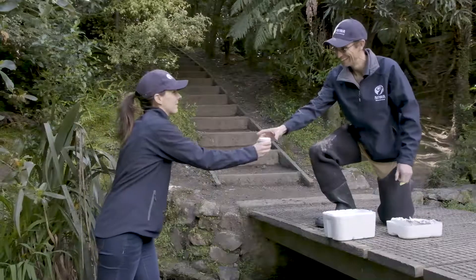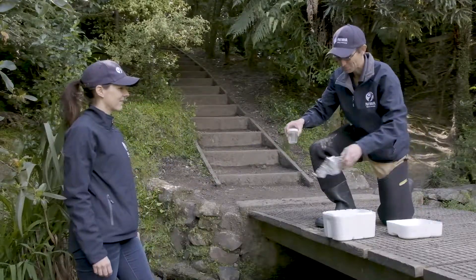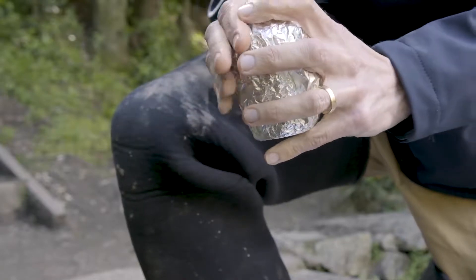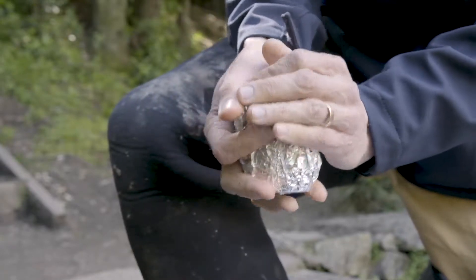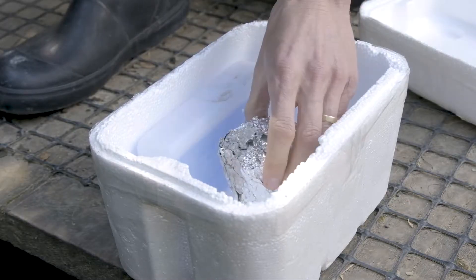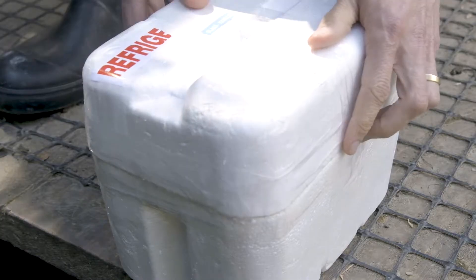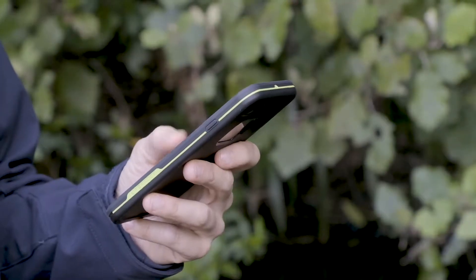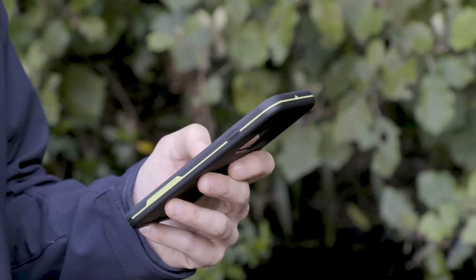For the E. coli test, collect your water sample just before you're ready to go home so that it's stored for as short a time as possible. After you collect it, you want to keep it cold and dark in something like a chilli bin. Bring it home as quickly as you can and put it in the fridge. Then you can watch the E. coli video and start the test.